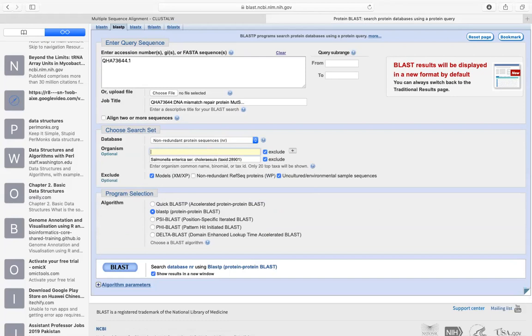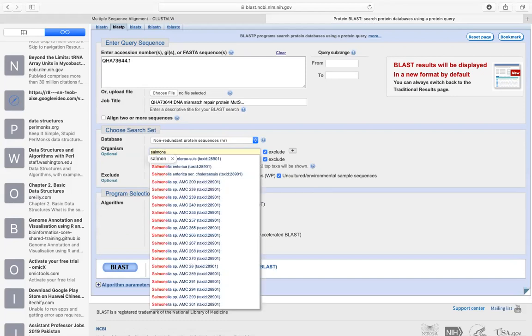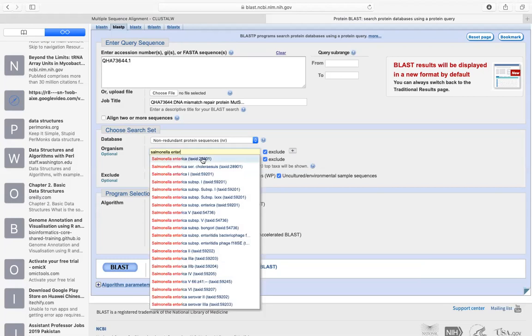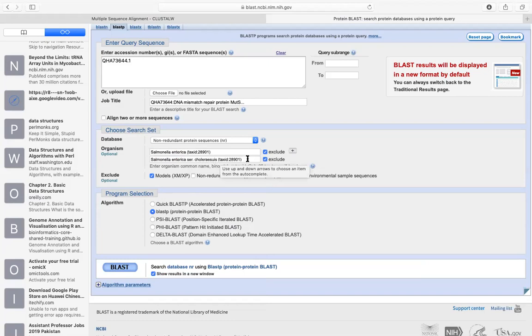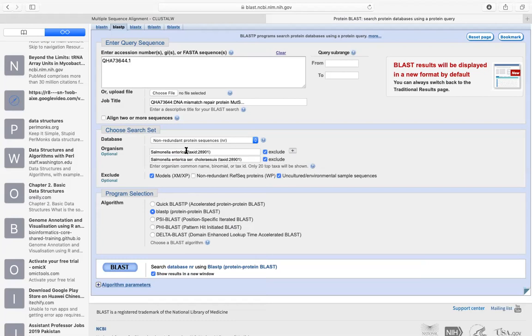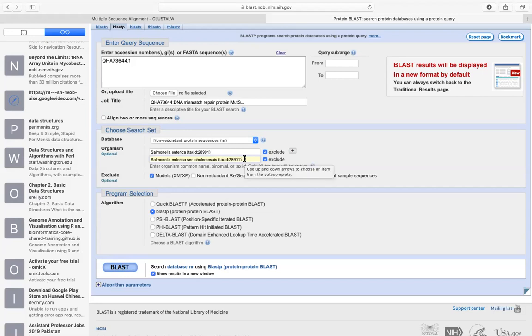You have to write the species name — Salmonella enterica — and click on it. Here you can see Salmonella enterica. You need to answer with the taxon ID. After clicking, this is Salmonella enterica, and I selected the species here. I checked the box so my BLAST will not match only with the same species — it will give me sequences from other species, showing which species are close.